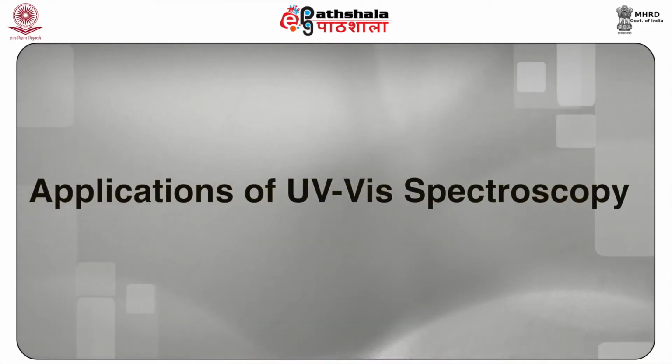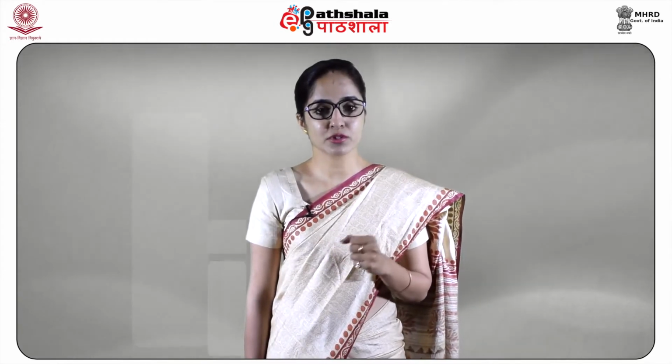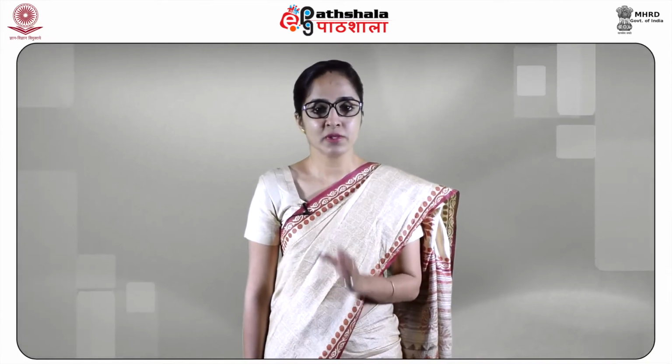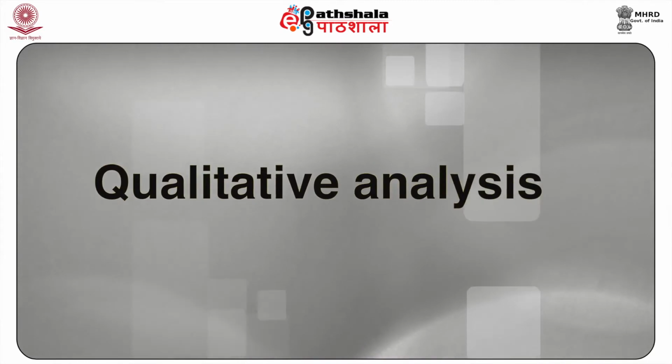Now, next is the applications of UV visible spectroscopy. Students, as such, UV visible spectroscopy is used extensively in teaching, research and analytical laboratories for the quantitative analysis of all molecules that absorb ultraviolet and visible electromagnetic radiations. The first application of such will be qualitative analysis.